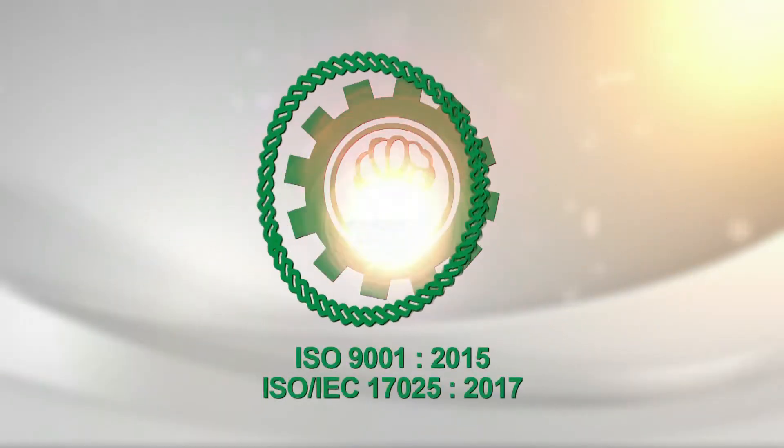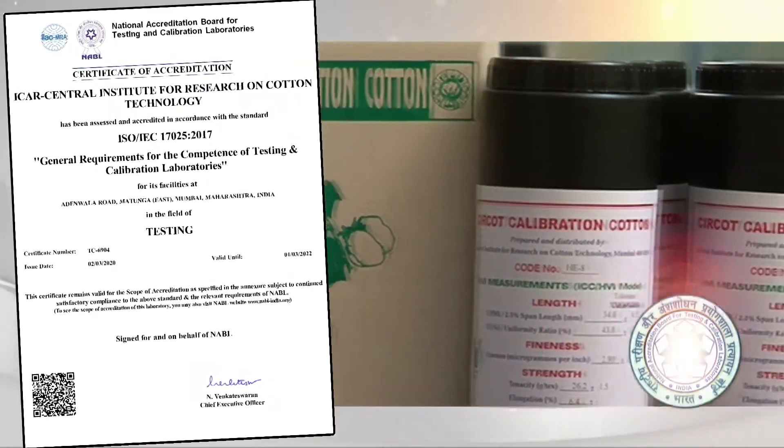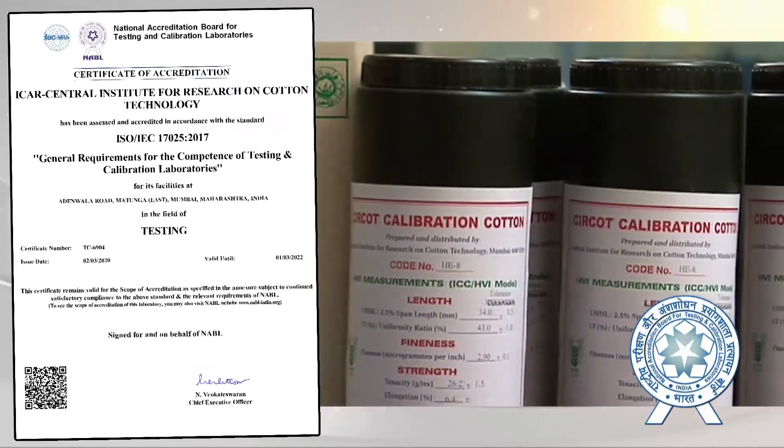CIRCOT is an ISO-certified institute and an accredited laboratory under NABL, functioning as a referral laboratory for cotton textile.